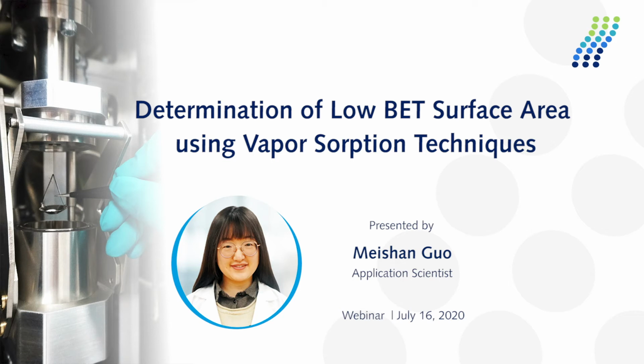So in the following 20 minutes, we will focus on the determination of the BET surface area with two unique techniques, the dynamic vapor sorption and the inverse gas chromatography. These two sorption techniques are especially suitable for some low surface area materials, for example, some organic materials, some metal powder, or the crystalline material with the surface area well below 1 square meter per gram. And the sorption technique in this case will give a more accurate and reproducible result that we will go into in detail later.